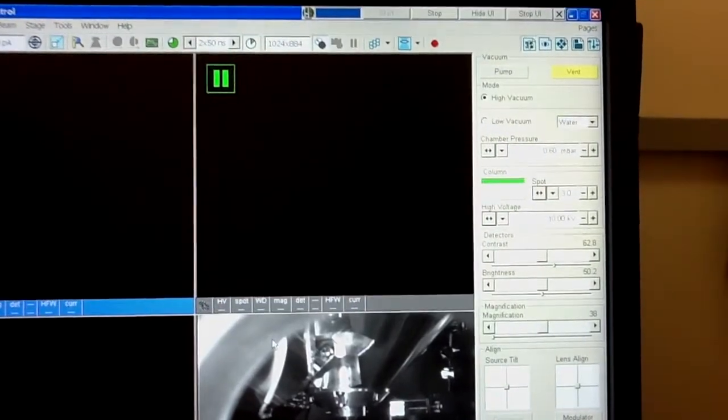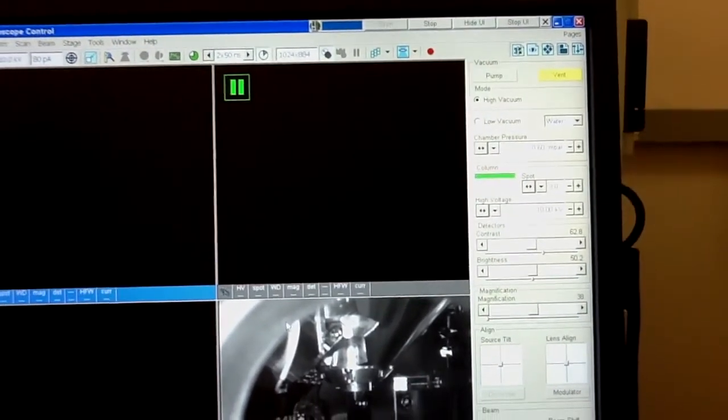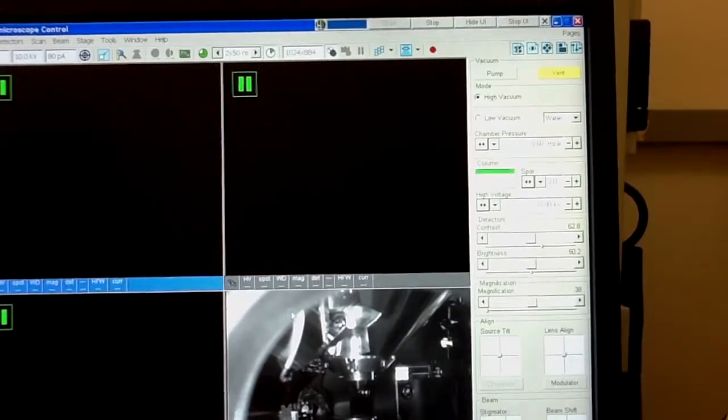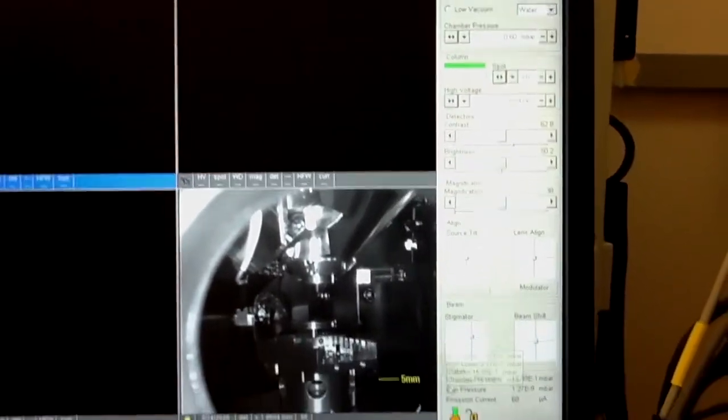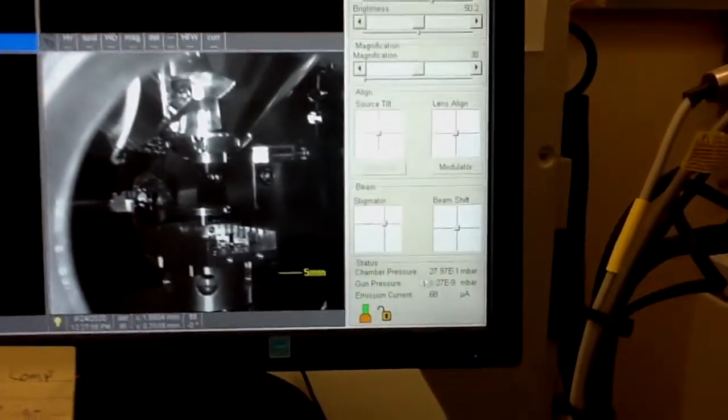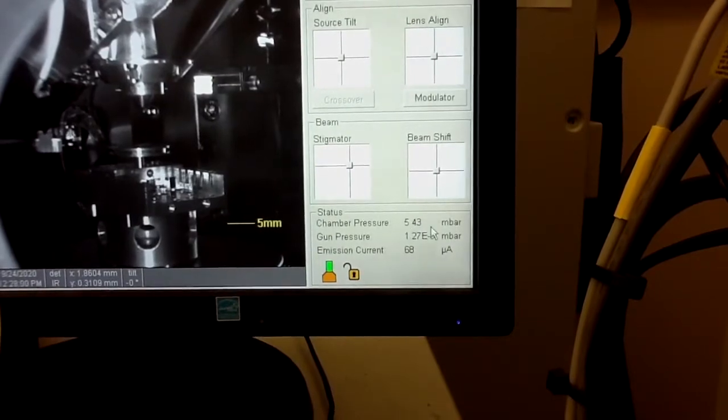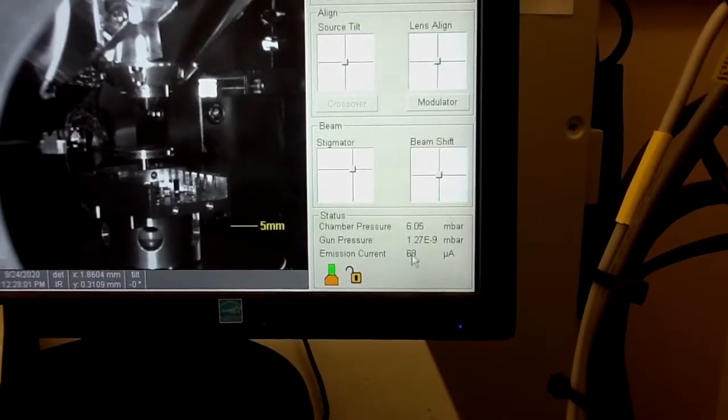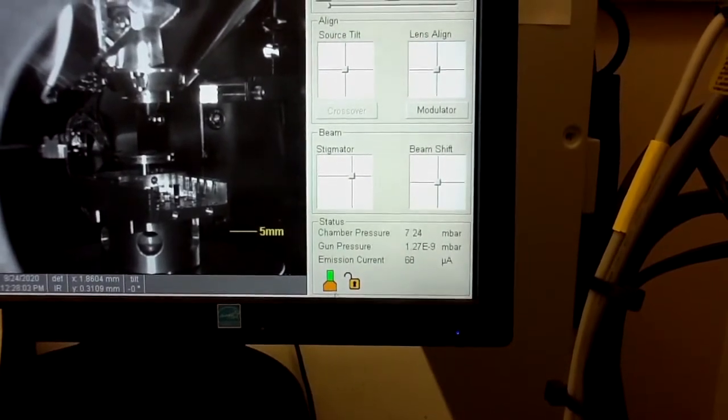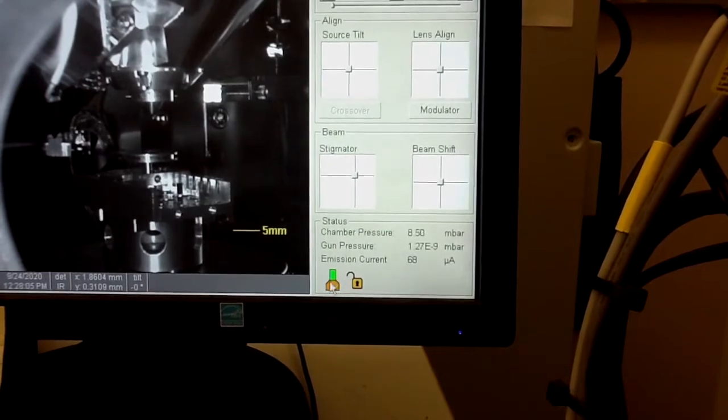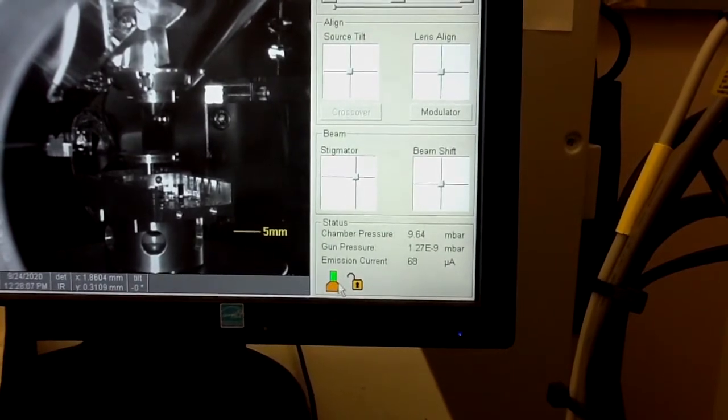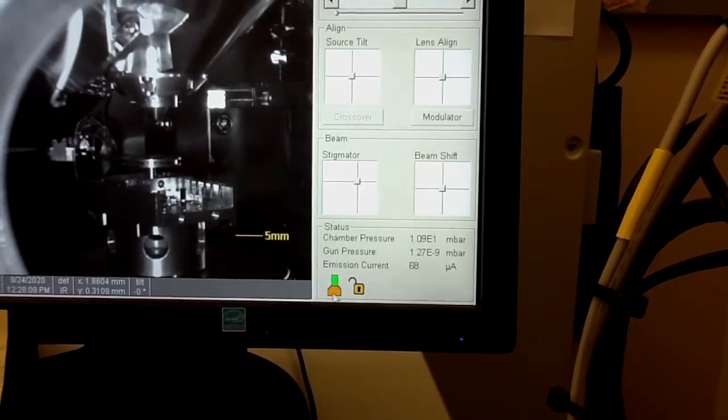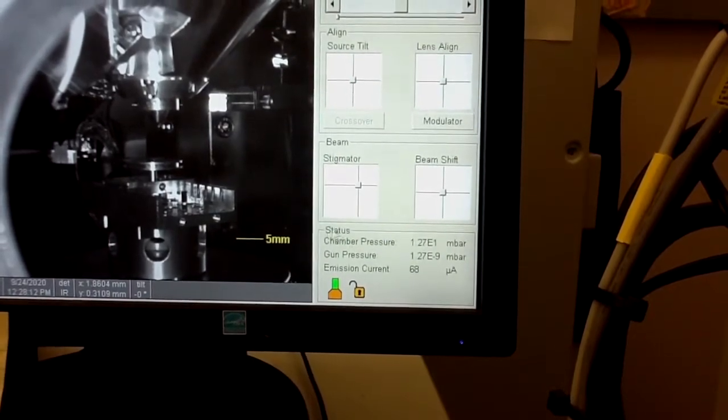Now you just press the vent button and confirm that you really want to vent the chamber. You have to wait a couple minutes for the process to end. At the bottom here, you will see that the pressure increases, the vacuum deteriorates. And this icon normally when the system is in full operation should be in green color. Right now it's in orange indicating that the system is vented.